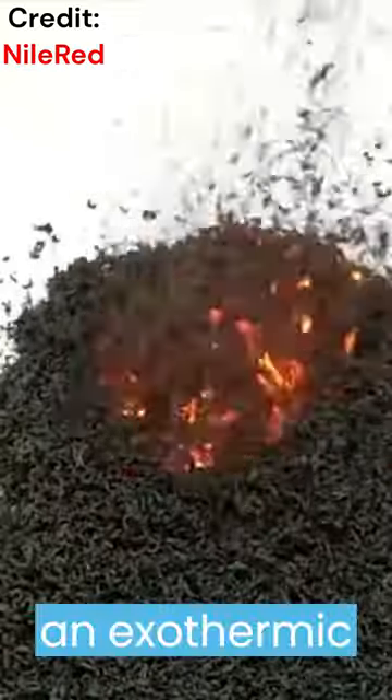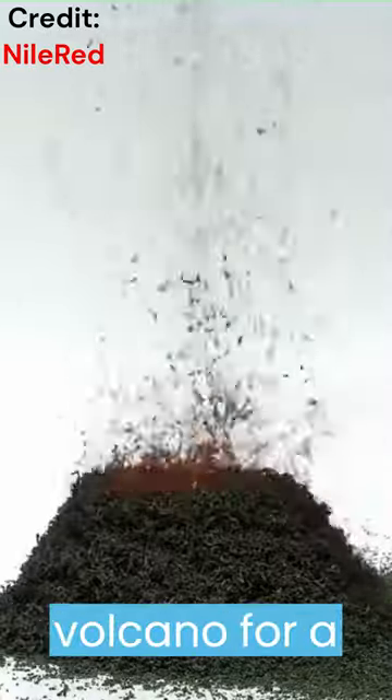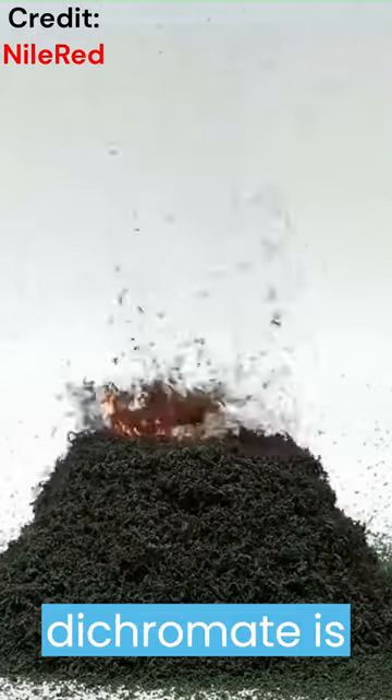This is an exothermic reaction, which means it releases heat and energy. This reaction can be used as a volcano for a science fair project, but be aware that ammonium dichromate is harmful.